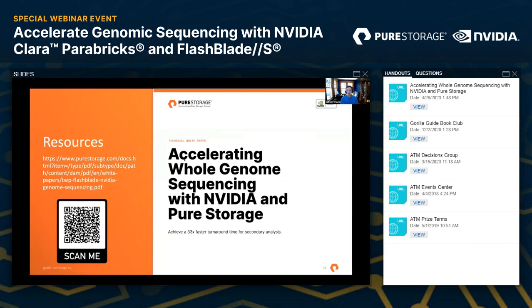One example that won the Gordon Bell Award at supercomputing last year was this model called GenSLM, which takes the ATCs and Gs, the DNA language of a COVID virus, of a variant of the virus, and then can predict whether that is a variant of concern that researchers and the government should look at, just based on running that sequence through a large language model. So that certainly will increase the amount of data and AI used in genomics in the future, those biological large language models, sort of similar to ChatGPT.